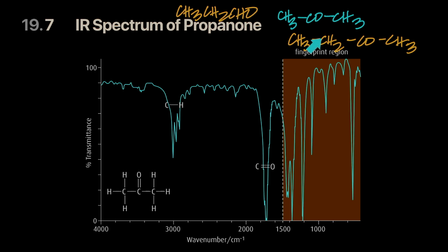So all of these three, by the way, will have a similar drop near 3000 and a much larger, or whatever, we don't care about the depth of the drop right now as much. Imagine that the depth didn't matter to us. So there was a drop around 3000 wave number and a drop near 1700 wave number.